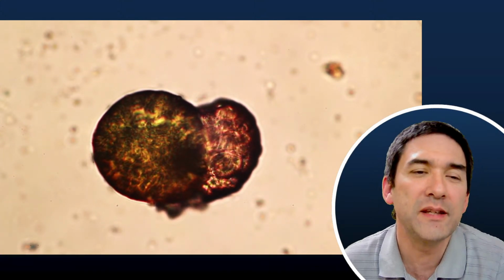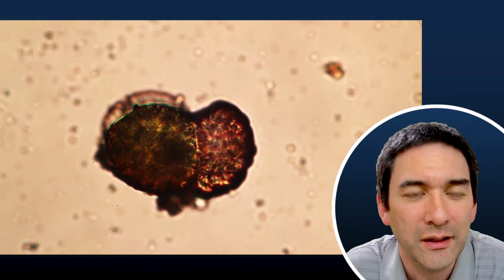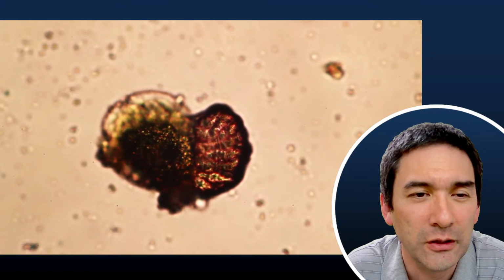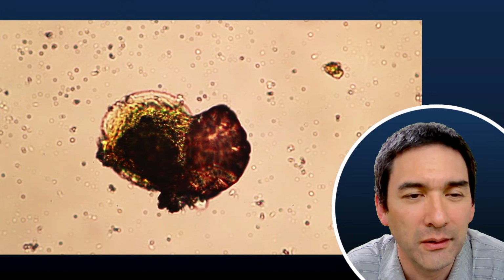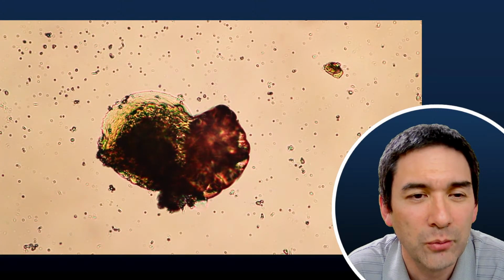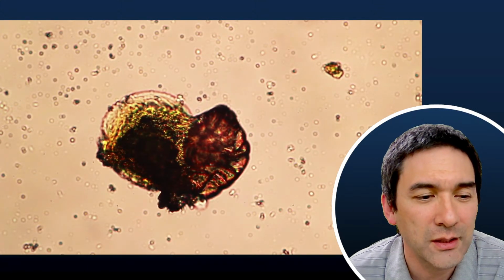So that's basically what I've done first, and then of course I tried to add some water, and I tried to revive it again after a couple of minutes. See, it completely dries up. Okay, so that's basically what I ended up with. And now in the second video, I'm going to add a little bit of water. And let's see what happens.